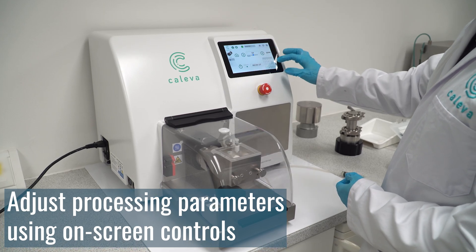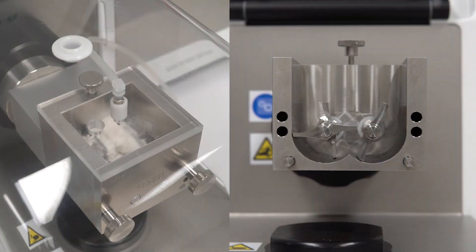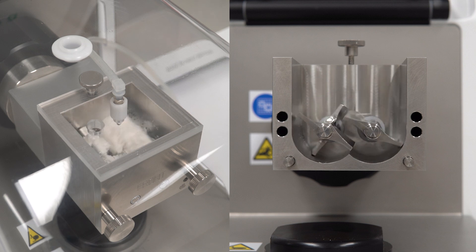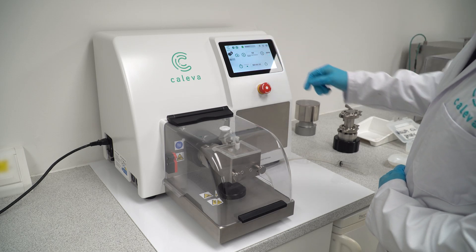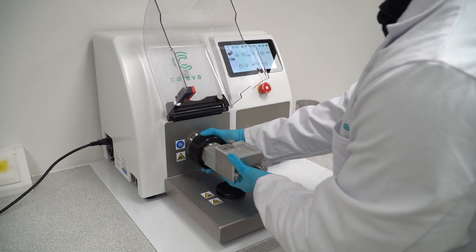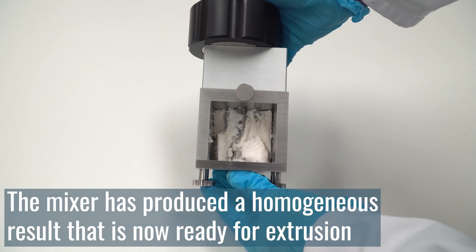Blade speed is adjustable by the operator using on-screen controls. Two counter-rotating blades operate at different speeds to provide a thorough mixing action. Once all liquid binder has been added and is adequately mixed, stop the mixer and remove your sample. The mixer has produced a homogenous result and the granulation is now ready for extrusion.